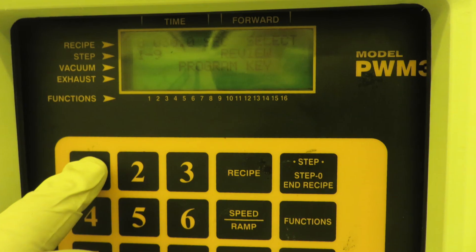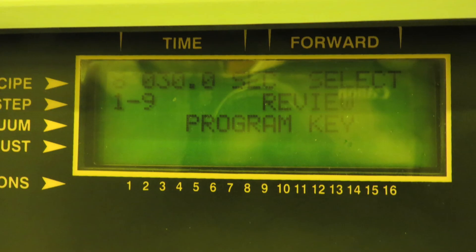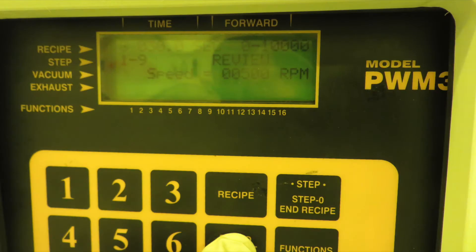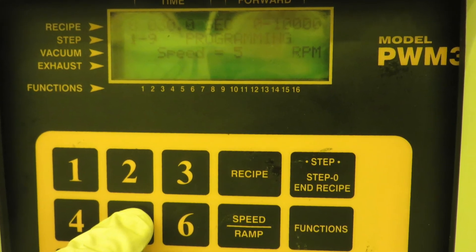Say you wanted to enter 500 RPM. You would punch in 5-0-0 and then enter. If you hit the same speed button, it toggles now to ramp. Remember that you won't actually make any changes unless you hit enter.